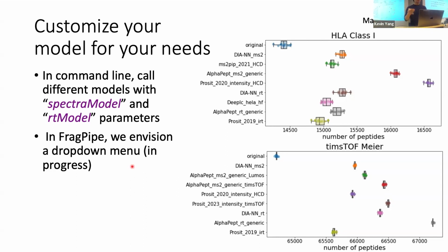So I think false positives are always an issue in proteomics, and I think we do our best to control for that. We do it at both the peptide level and the protein level. But yeah, hopefully the idea is generalizable, and by showing a single example or maybe multiple examples in the paper, people will have some more utility in that. But it's a good point.